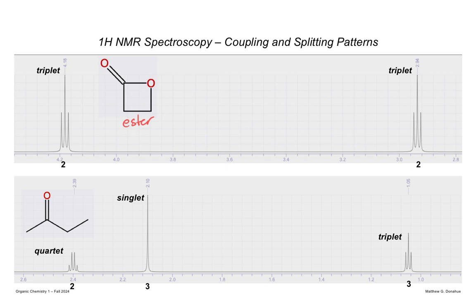So we'll say the blue triplet belongs to that CH2 group, and the green one here belongs to that one, based on the substitutions that they've done to push the chemical shift away from zero. Since each of those is a unique set, you look to the neighbors. They each have two neighbors, so 2 plus 1, that's your triplet. And within the triplet, we sort of draw a line.